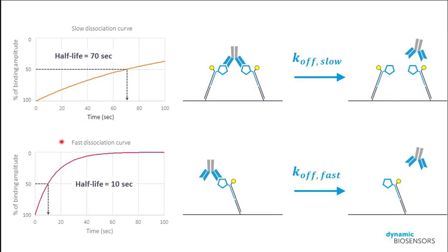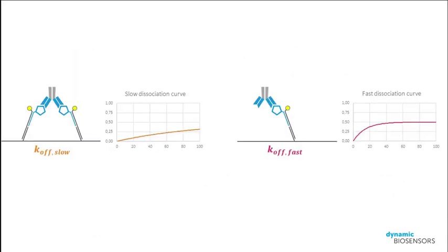As already mentioned, both the stronger binding mode with both arms and the weaker binding mode with only one arm attached can be described by such a mono-exponential curve. The only difference is the binding strength, indicated here by the very different half-times. On the biochip surface, however, we rarely can observe the pure affinity or avidity binding modes, but rather a mixture of both. This is dependent on many different parameters, such as the binding strength or the surface density.